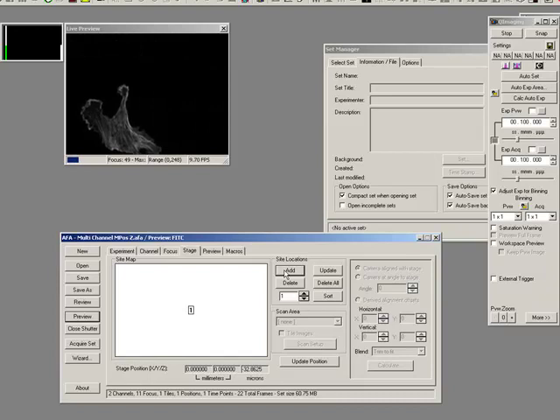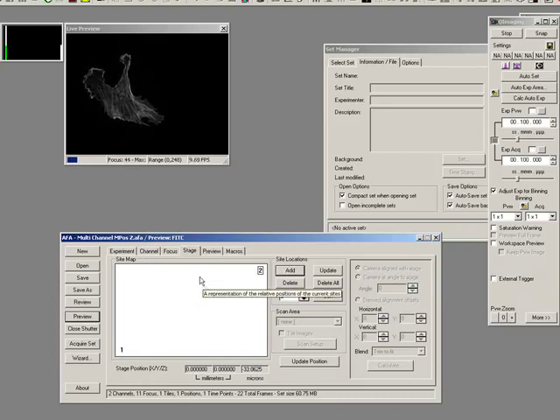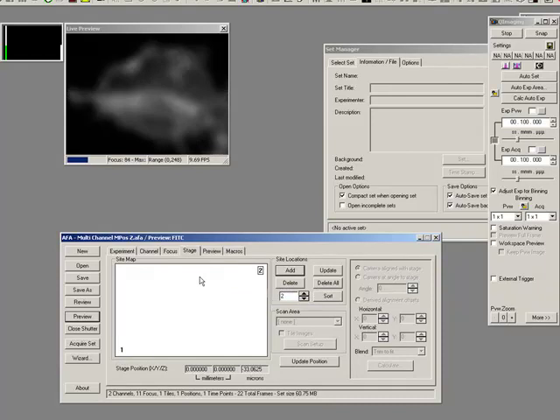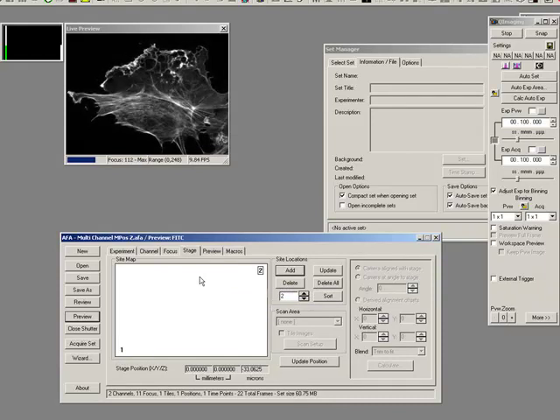Let's see if we can find something else. And go, yep, you're a site as well. And I can focus in on that if I want. Cool. And let's do another one. I can do a lot actually. One thing that's really nice is if I was doing multiple positions in a well, I can actually do these positions and do a little tile at each position as well.